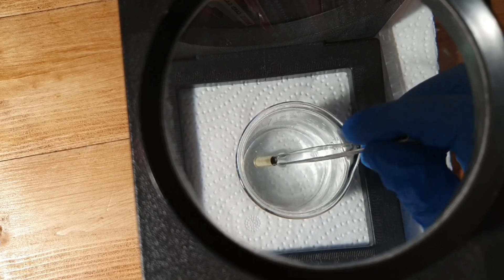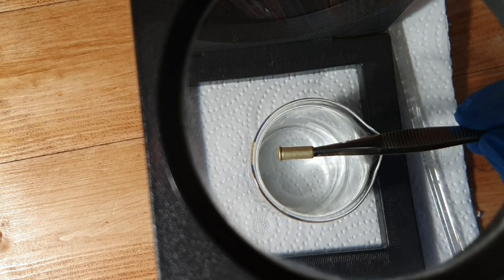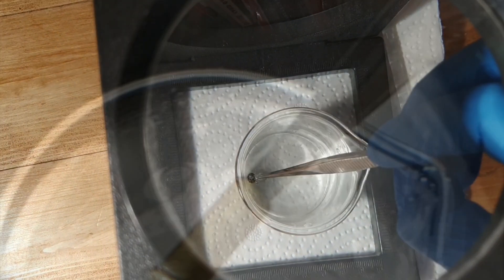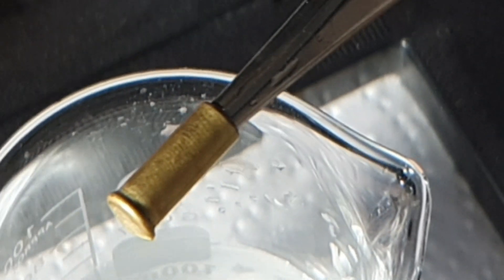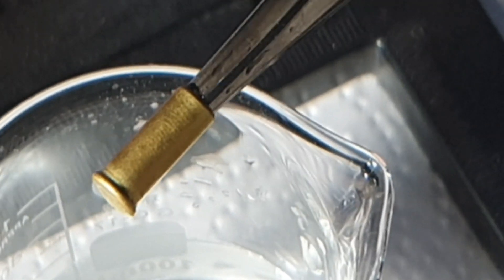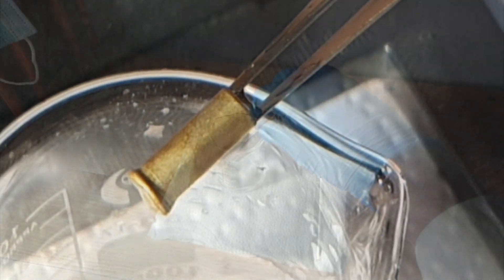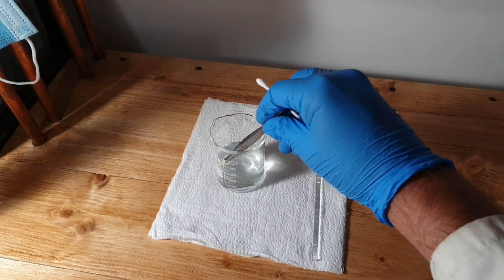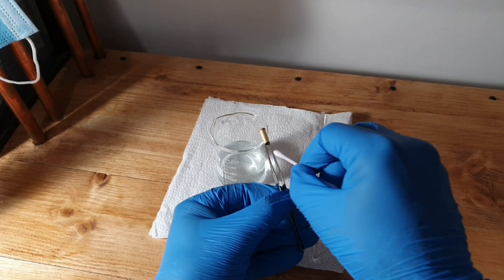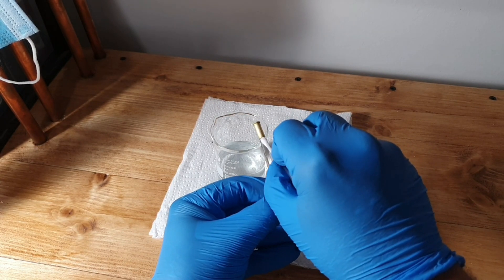At about three minutes I took a look to see if anything had been revealed — the fingerprint itself, I didn't see much. After four minutes, this is what I got. I can vaguely see some ridges there, so it's definitely becoming more apparent. Now we're talking about six minutes. After six minutes I'm confident we're going to have some sort of print.